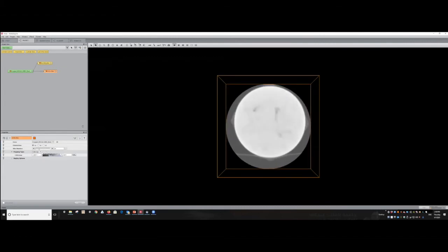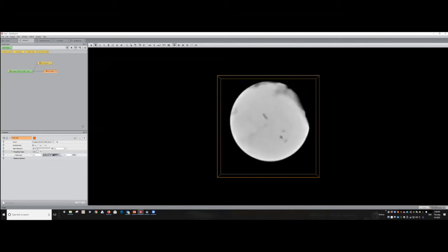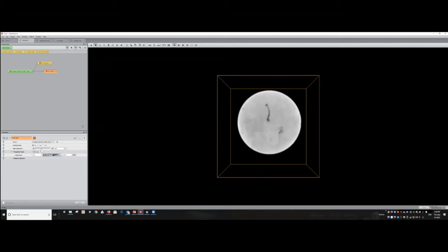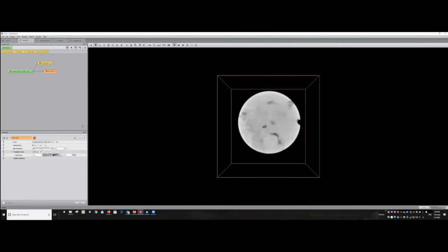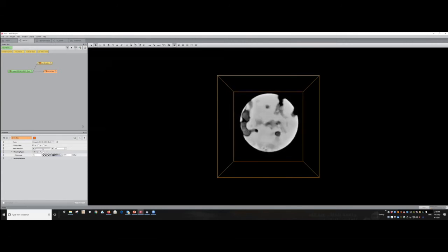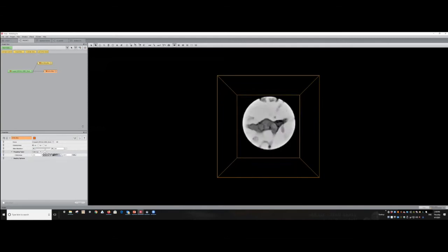And over here, this is a color map, it's a grayscale image. What I will do is change and adjust the range to the data window. If I do that, it will select the correct range of this image sequence. Now, as you can see, if I go through the images, I can see a much clearer contrast, better quality, and I can see the data better.